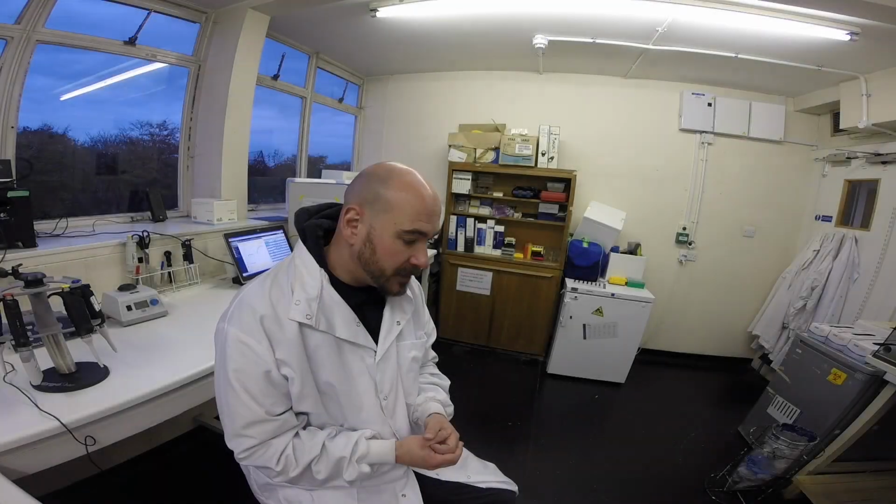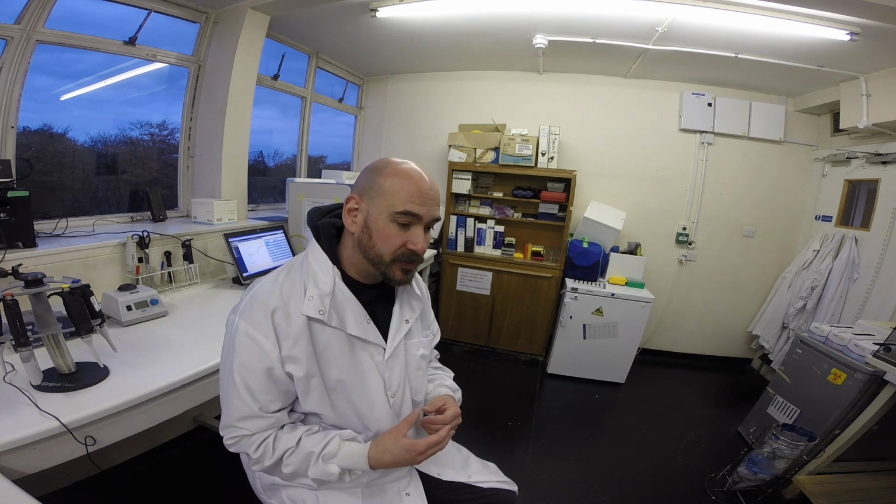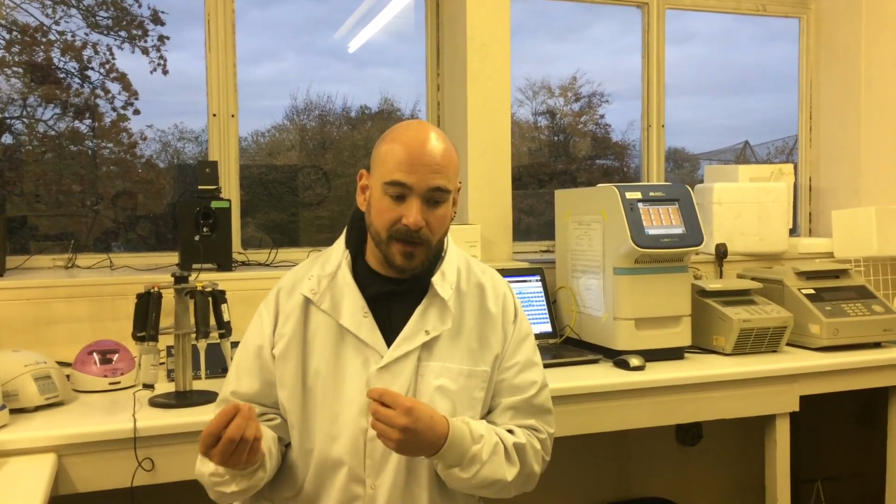If you've got an animal, you want to be able to test it on the spot and say, right, is this animal infected? Now, if you can do that, then you can actually do something there and then. LAMP enables this because the way it amplifies is that it runs at a single temperature, and this reduces the actual amount of energy that's required in order to run a sample, which means that it can be run off a lithium battery. Now, if you do that, you could swab the animal, run the assay, and then get a result, all in maybe 15 minutes.